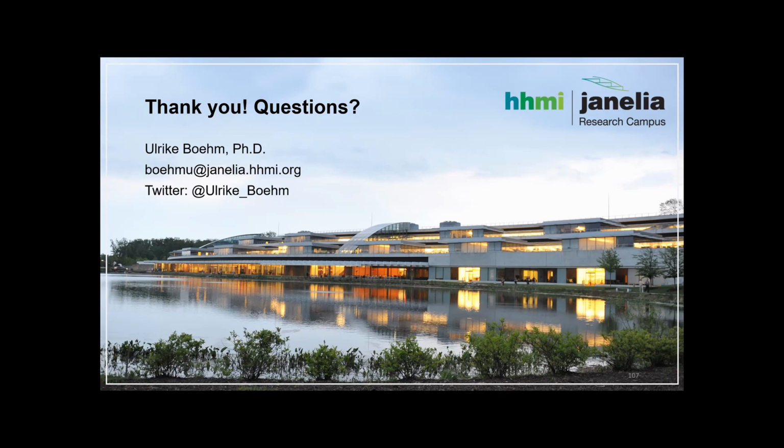Thanks, Steve, and you're right. My question is, you gave a really excellent report on single molecule localization microscopy, which required special dyes, picking a suitable buffer, and a lot of post-processing. Because you are really an expert in this field, if you look at the future, what kind of super resolution technology will develop very quickly and be easy to use, not really one click, but more user friendly for users in the biology fields? So what do you think?